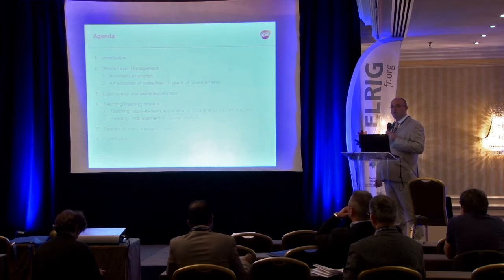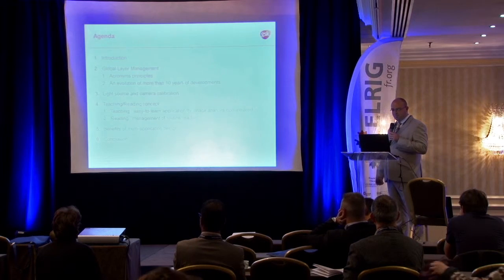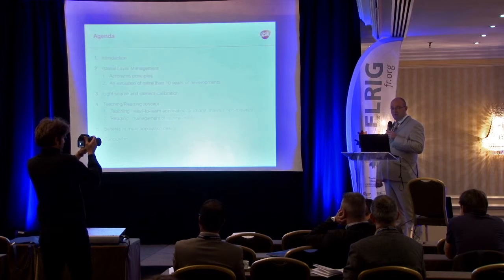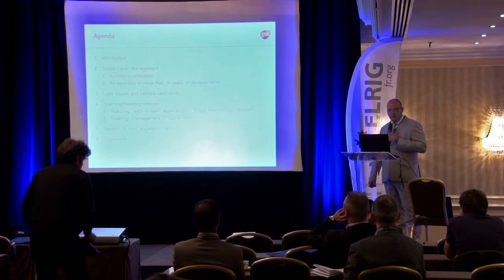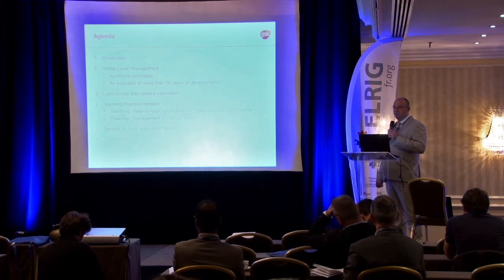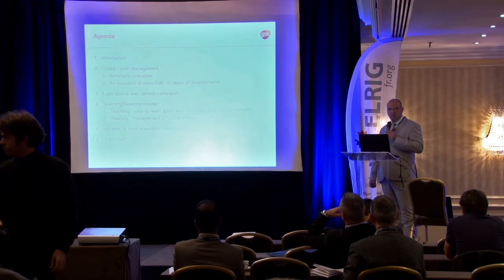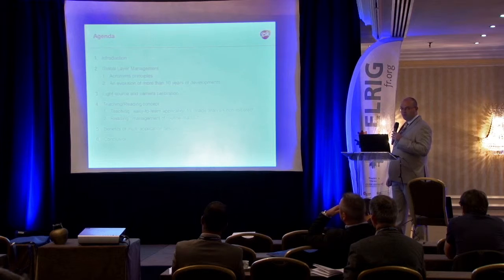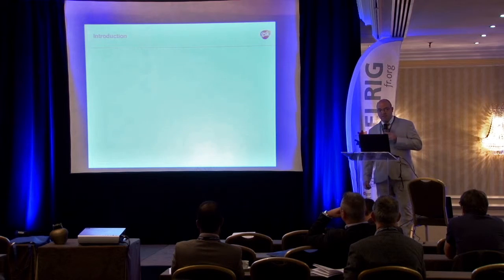I'll start with a short introduction, and then we'll talk a little bit about what a global layer management is, and what the key elements to take into account are. We also have a topic about light source and camera calibration, which is very important when you have multiple systems. And the teaching and reading concept is a very specific application that we have developed in the team, and it is very useful for the users in the lab. To close the presentation, we'll talk about the benefits of the multi-application design of the systems, with a short conclusion. So first, introduction.